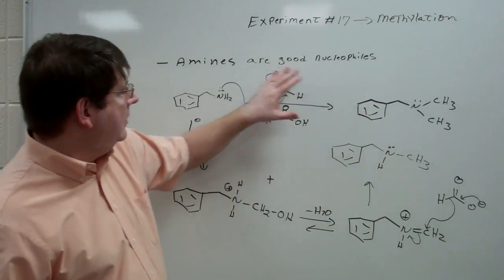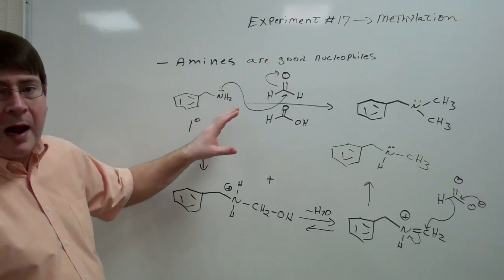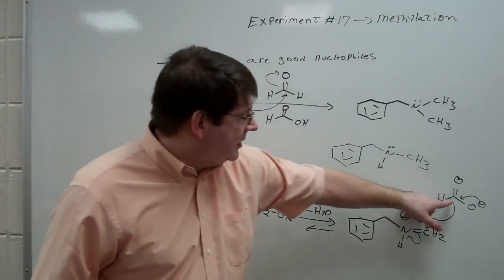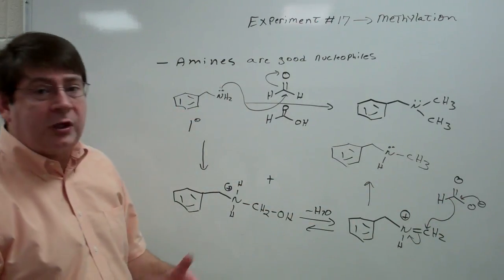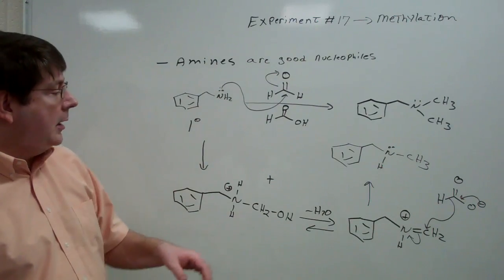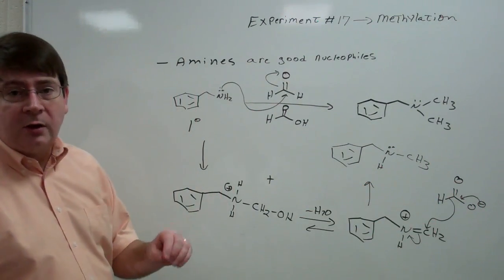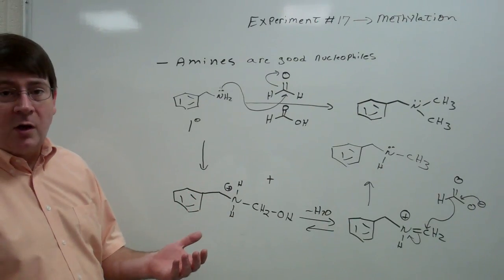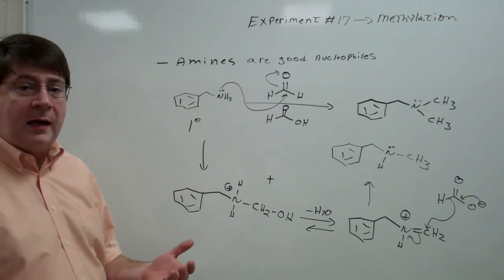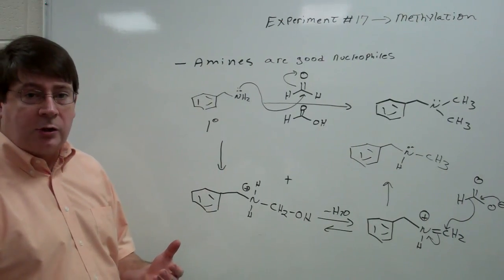You're going to be mixing these together and heating them up at a fairly high temperature. You should see rapid bubbling because as this process works, you're losing carbon dioxide, of course, which is a gas, and you will actually see your reaction bubble quite vigorously in the process. So make sure that nothing bubbles out of the flask, that you don't add the reagents too vigorously. Follow that procedure pretty much to the letter as it's listed in the manual, and you should be okay.